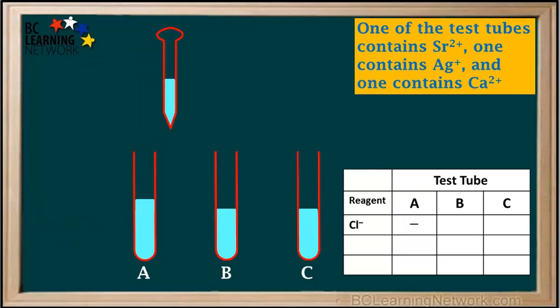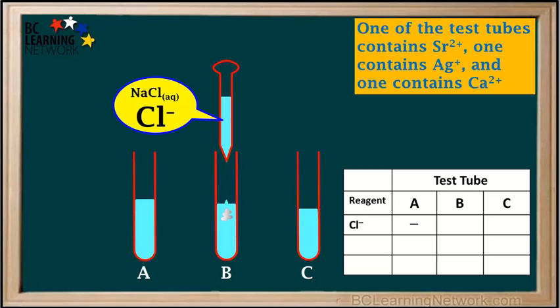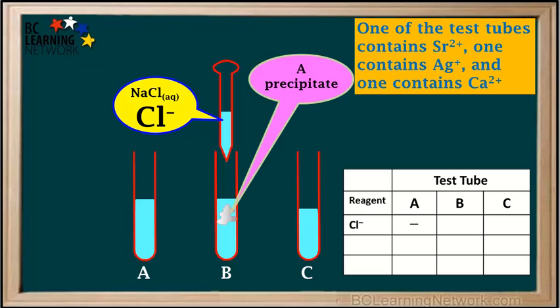Now we'll take the pipette out, refill it, and move it over to test tube B. We'll add the chloride solution to test tube B — watch what happens. A precipitate is formed. This is a compound with low solubility. To record this result, we write PPT for precipitate in the cell for chloride added to test tube B.